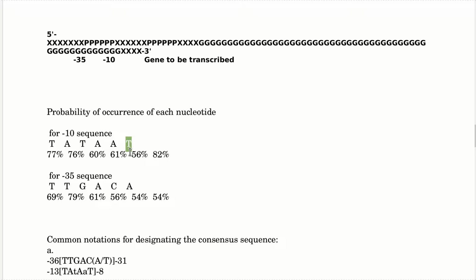So there's a T here, the two strong ones. So there's a T here and a TA. So if I were looking at this, I would say we're looking for two T's that have 4 of something in between them. So if you're really looking for a TATA box, the strongest percentages here show you that it's probably a TA.